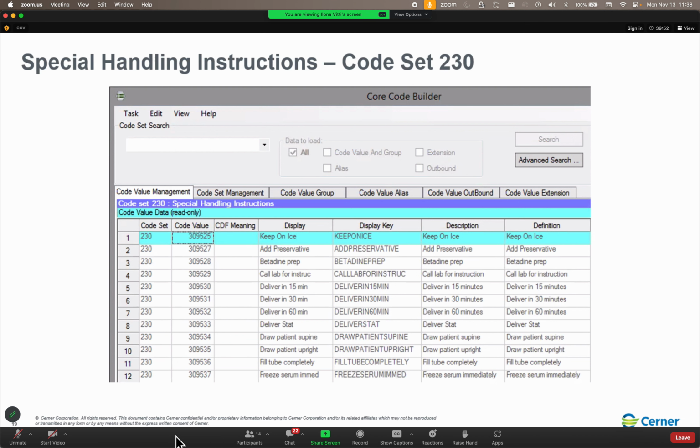And then, folks, I just want to remind you that collection requirements inquiry is a great tool for reviewing your build, because Bedrock does have a couple of reports out there, but the reports are actually split into collections with aliquot details and collections with alternate container details, but you don't get both.